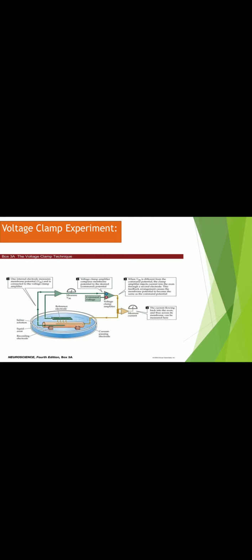Then two other scientists, Neher and Sakmann, came into existence in the late 70s, who modified, or we can say advanced, the voltage clamp technique. For the first time in history, they were able to determine the single channel current across a membrane. The whole experiment was carried out in frog skeletal muscles, using the patch clamp technique. Again, they were both awarded the Nobel Prize in Physiology and Medicine in 1991.